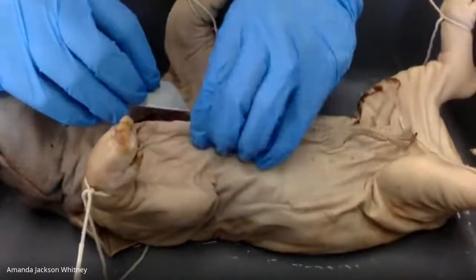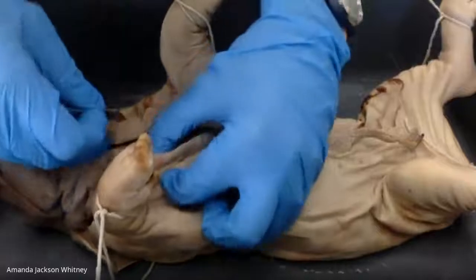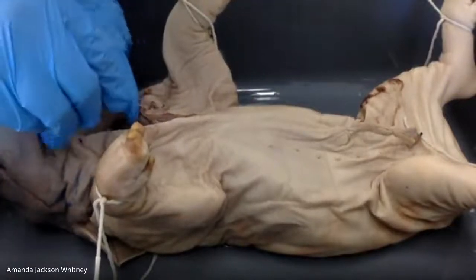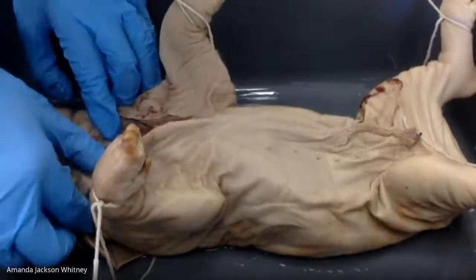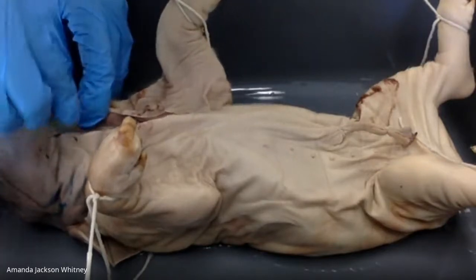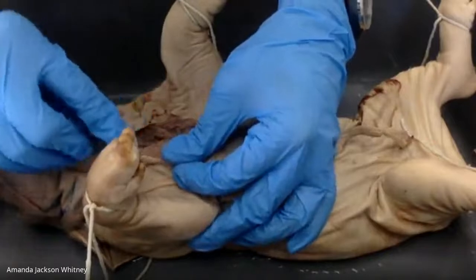What are some of the muscles that we know of that are around the thoracic cavity? Back to our last unit. Muscles, anyone remember? What are some of the muscles that help us breathe? What are those called?